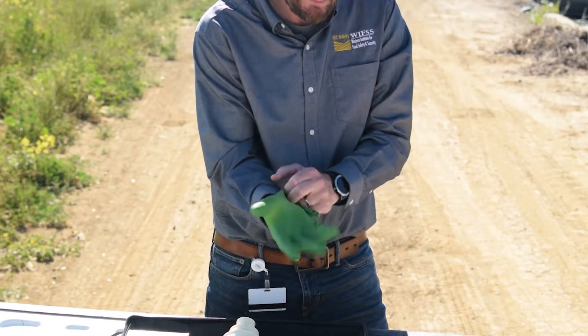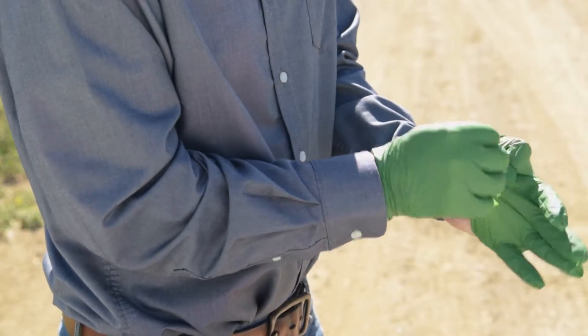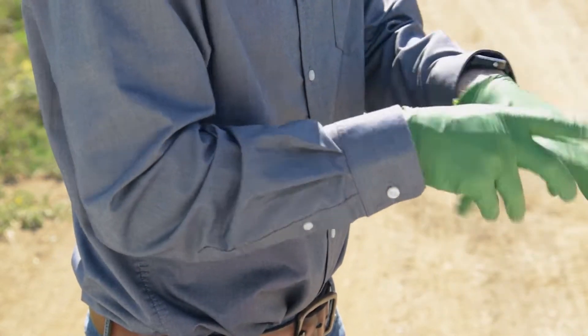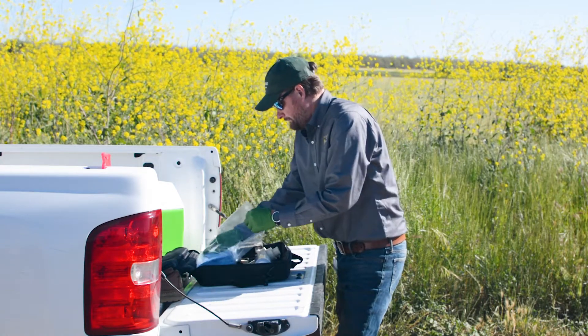First, put on clean gloves. Be careful not to touch anything that could be dirty, like the ground or your clothing. Wearing gloves does not automatically prevent you from contaminating your sample, but they can help keep things clean.